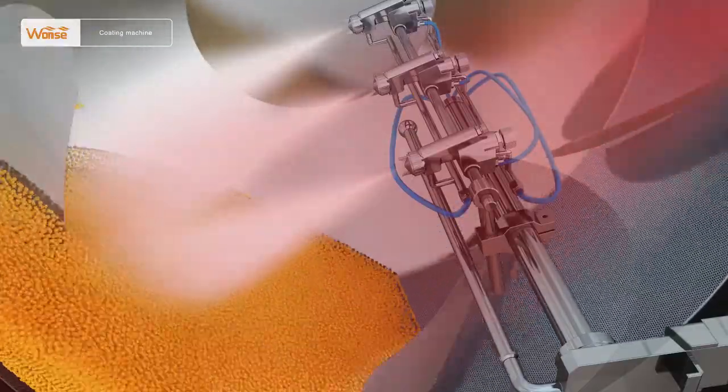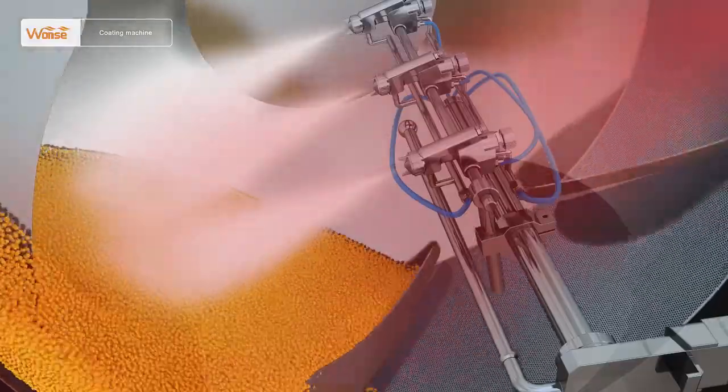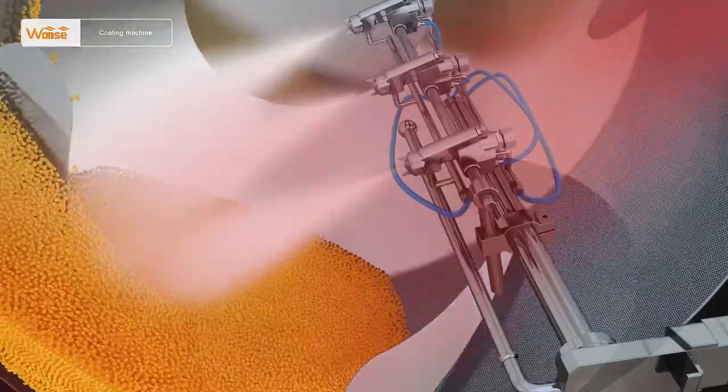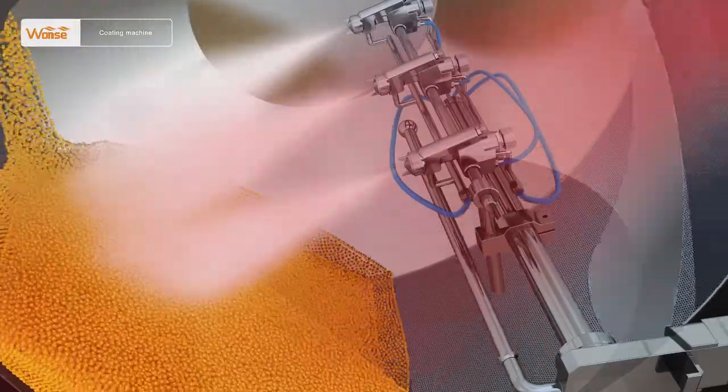The air exhaust volume is greater than the air intake volume to ensure that there is negative pressure in the drum, making the media spray onto the surfaces, dried rapidly and evenly, and form a solid and smooth film on the surfaces.